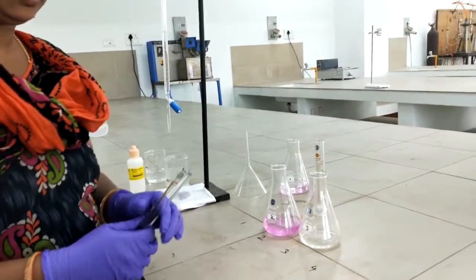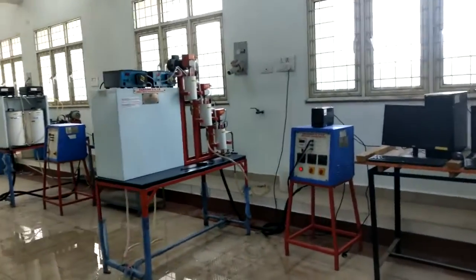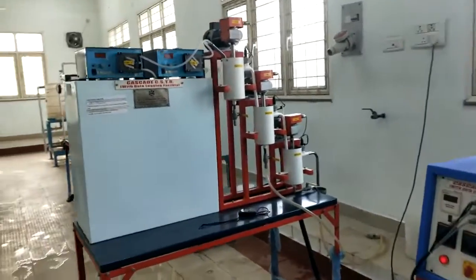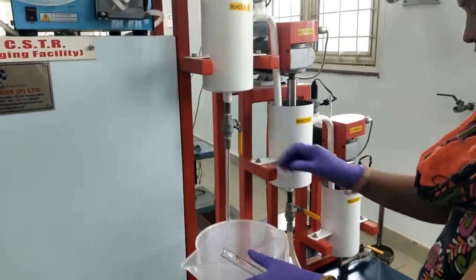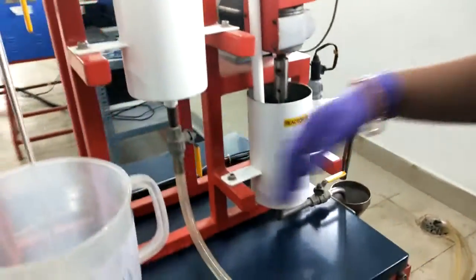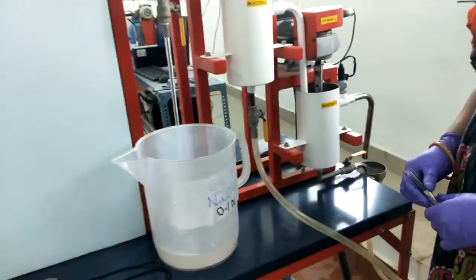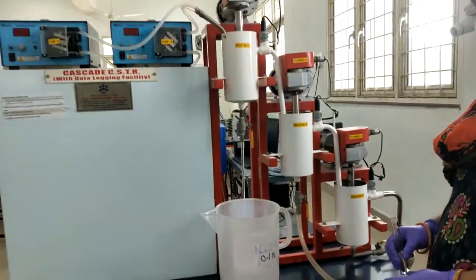Now we will go to perform the third set of readings. So before that we have to empty the tanks, empty the reactor 1, 2 and 3. So open the valves at the bottom of the reactor 1, 2 and 3, and we are emptying the tanks 1, 2 and 3.